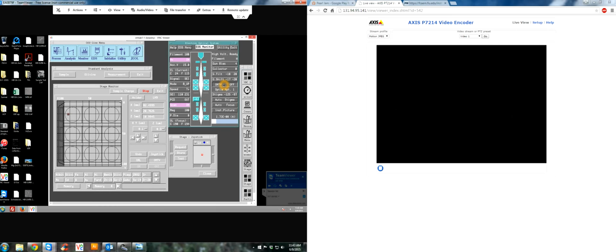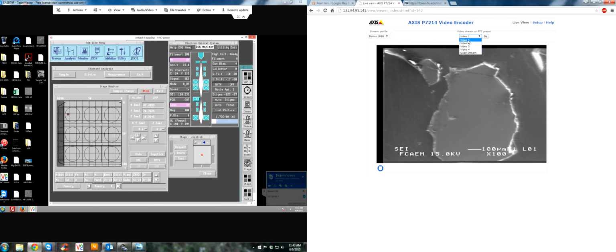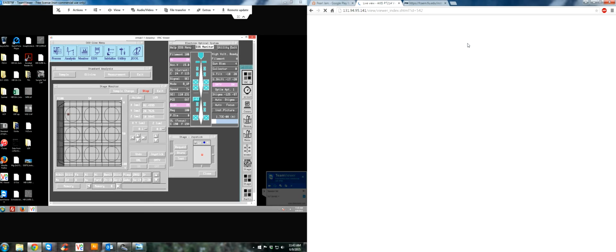And just in case you didn't know, a lot of times we'll use EDS to just verify that this is in fact olivine. Let's make sure we're optically focused. You'd be surprised. Yes, we're optically focused. Okay, turn our scan generator off, close our PCD, open up our EDS menu, click on EDS. Alright, and hit acquire. Oops, sorry, not that one. This button, acquire.